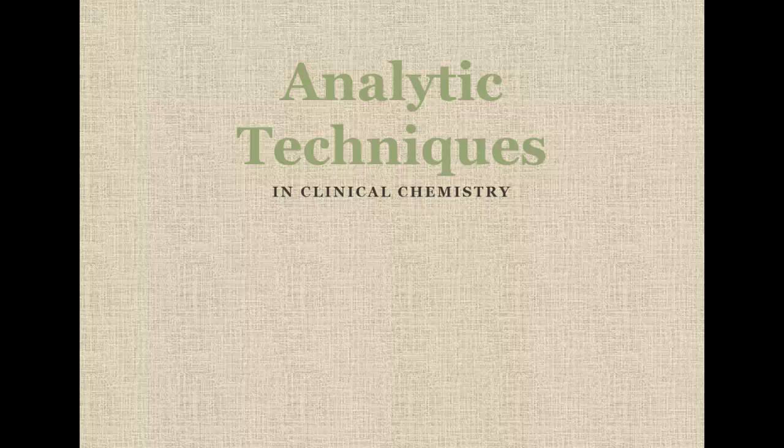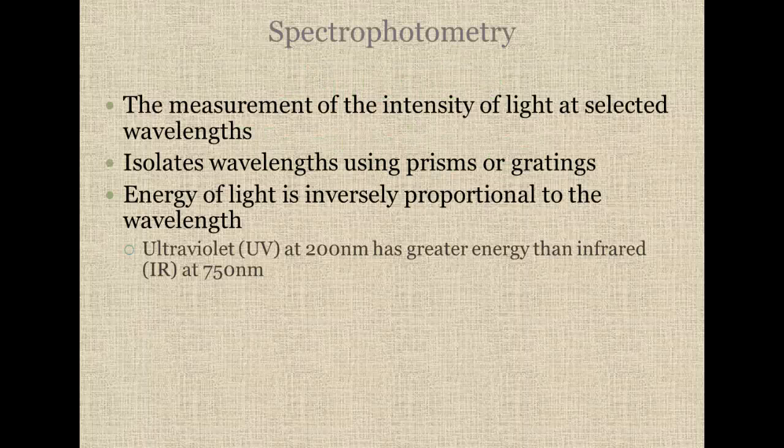Analytic techniques in clinical chemistry. The first technique we're going to start off with is spectrophotometry. This is the measure of the intensity of light at selected wavelengths. It isolates wavelengths using prisms or gratings, and the energy of light is inversely proportional to the wavelength.